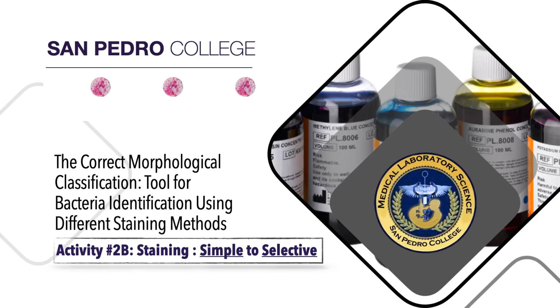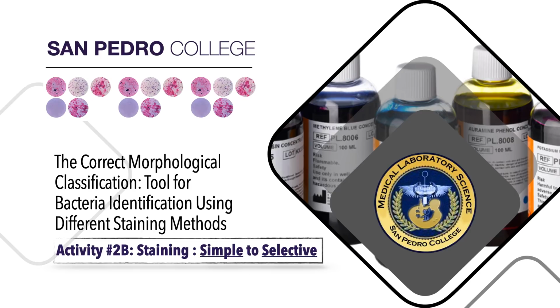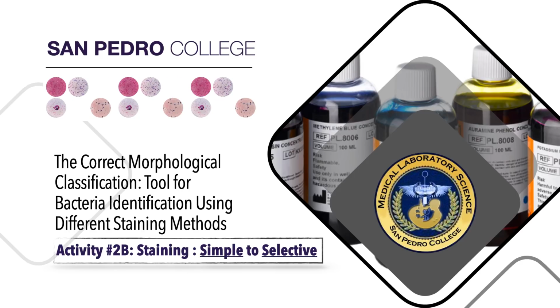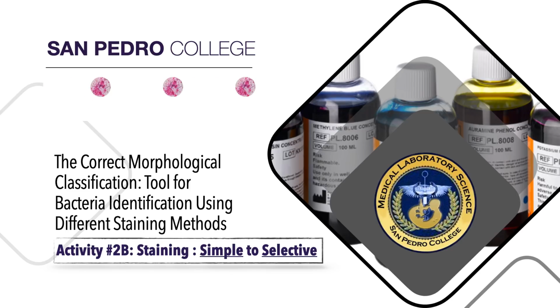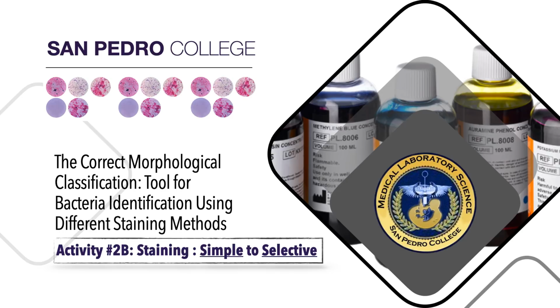Now, you would be wondering, why are you telling me that they are not colored? What you showed us last time was colored. Are you scamming us, ma'am? Of course not. We made it colorful. That was visually enhanced. We made the animation to spark interest in you. But of course, they would not look like that under the microscope.